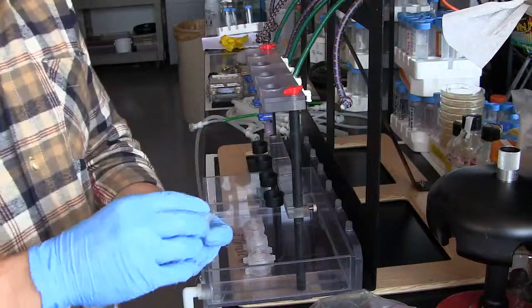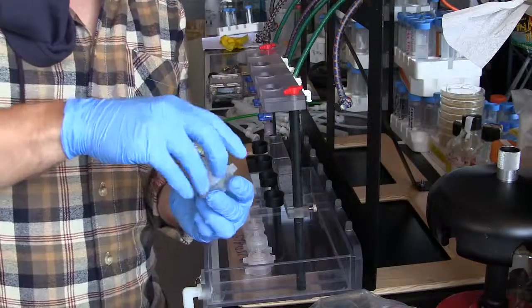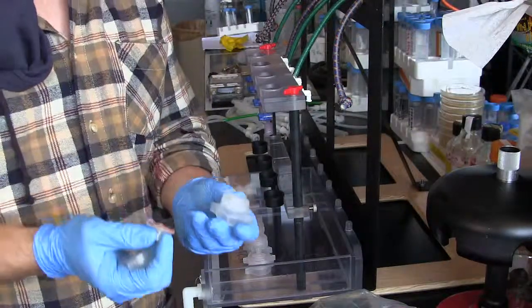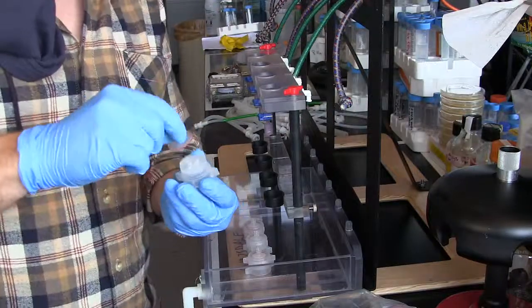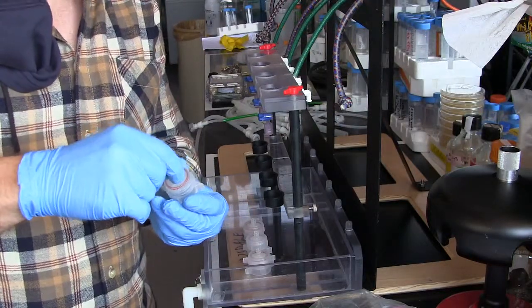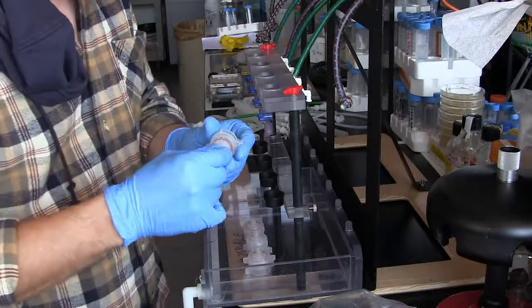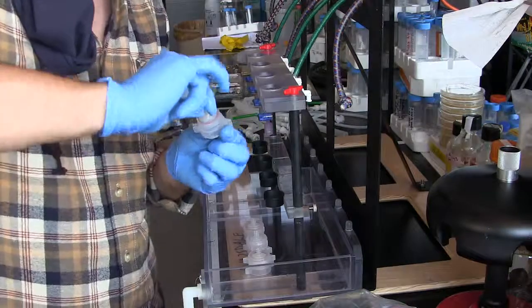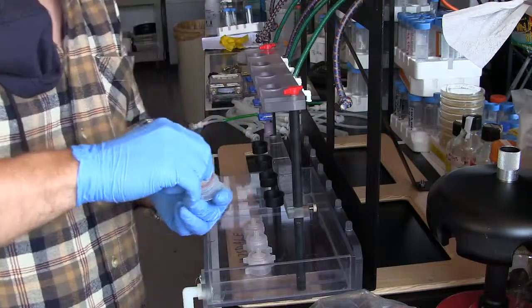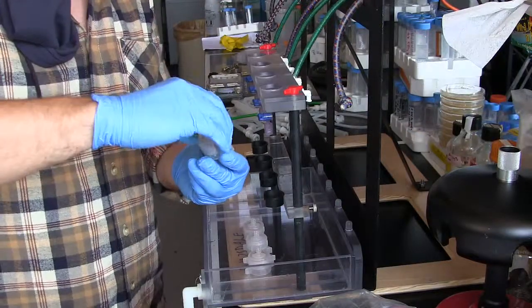Okay, a filter holder looks like this. You open it by untwisting the top ring. Then inside you'll see a backing here. That's where the filter sits on. Then you have a little piece that comes in on top, the lid of it. You'll see there are little tiny teeth in here that line up with the little crenellations on the side of the filter holder here, so it cannot be twisted. That's good because if that twists, it can start shredding your filter when you go to tighten that ring down.